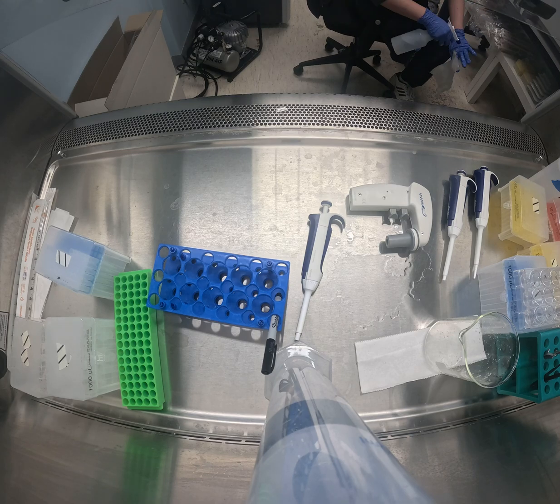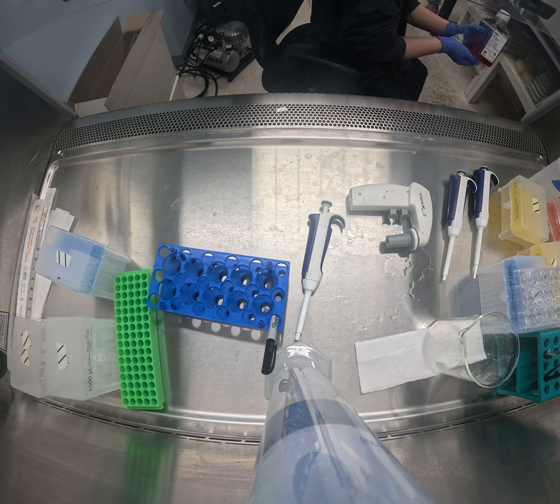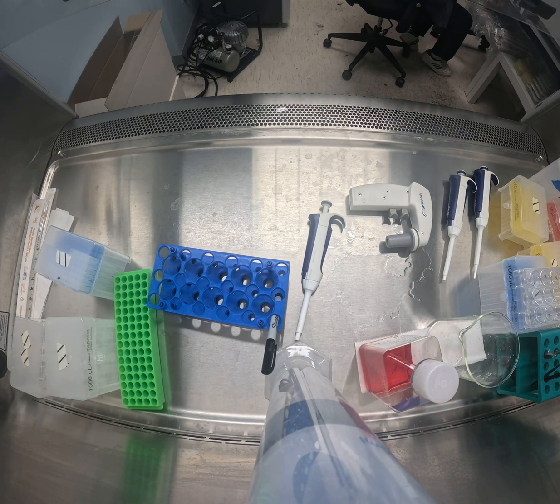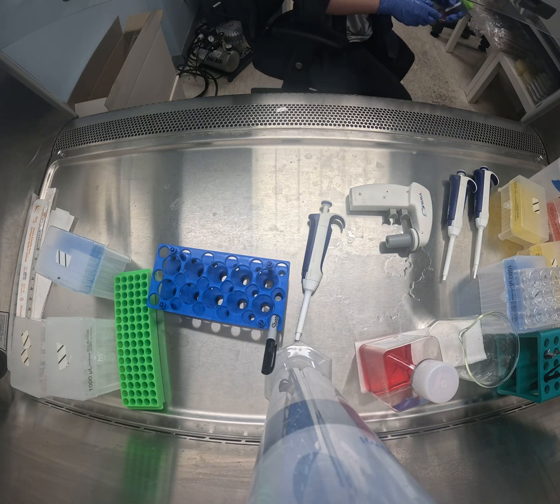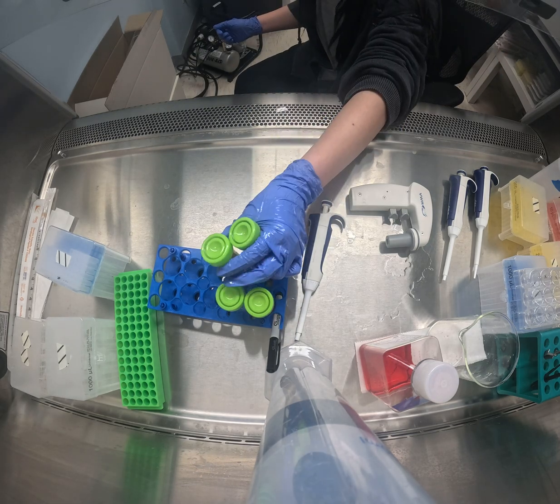If anything falls onto the floor, use a paper towel to get any dirt or potential contaminants off of it before placing it into the flow hood. And anytime you set up the bench, be sure that you have everything organized beforehand and keep the area clean at all times, wiping up any spills immediately after they happen.